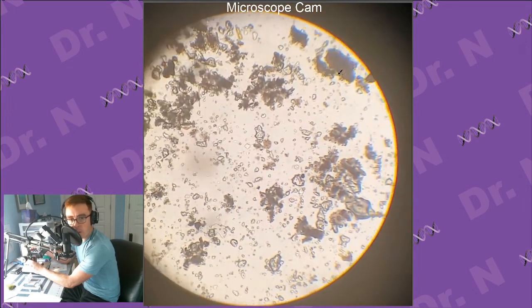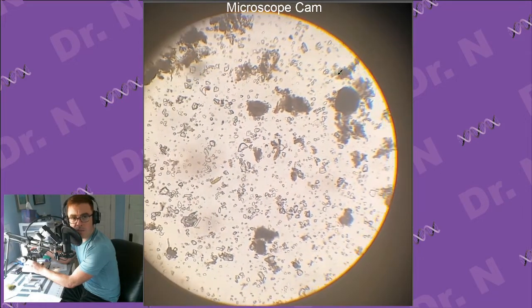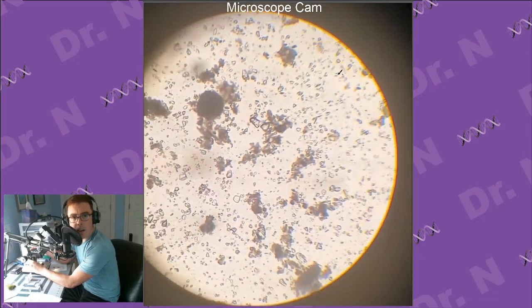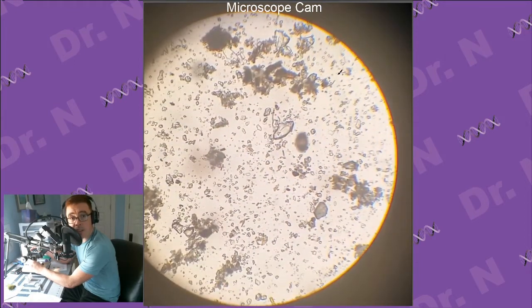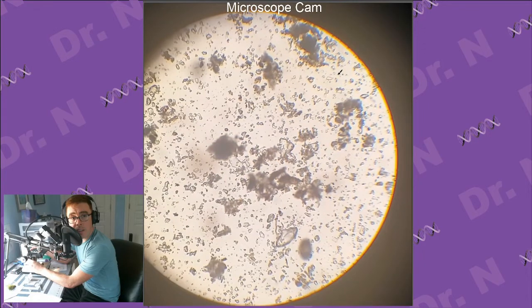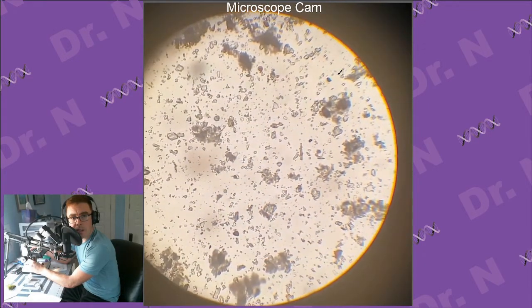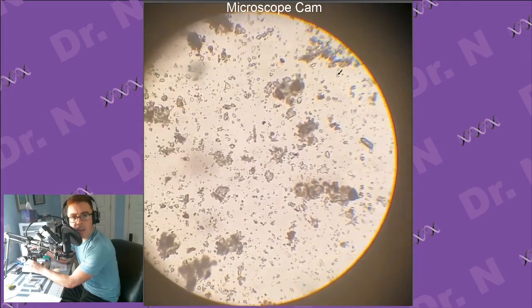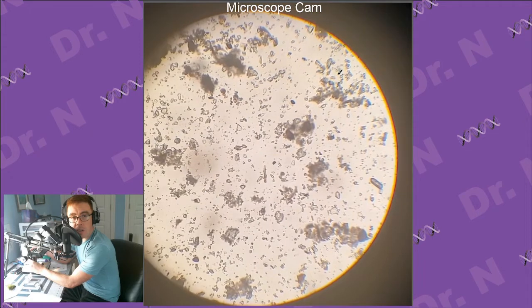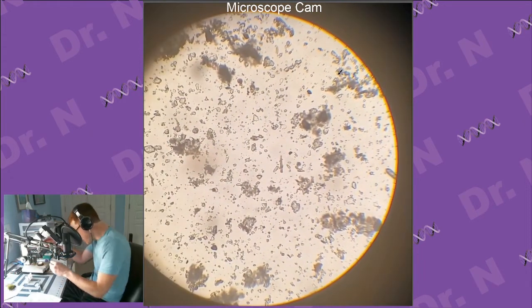Now, I could use that blue-colored stain that I have. That stains basically DNA. Only problem is that it just kills everything. That rod looking thing also might be something that's alive. If I kill everything, it's far less interesting to watch if it actually starts to move around. I'm going to zoom in.